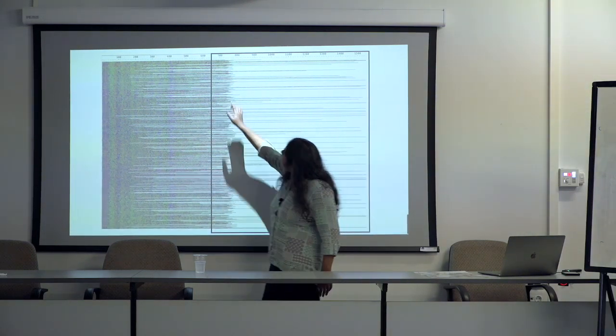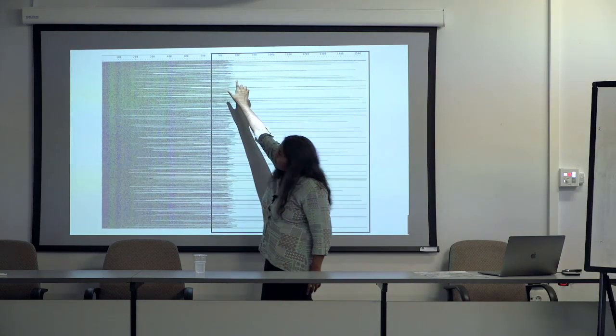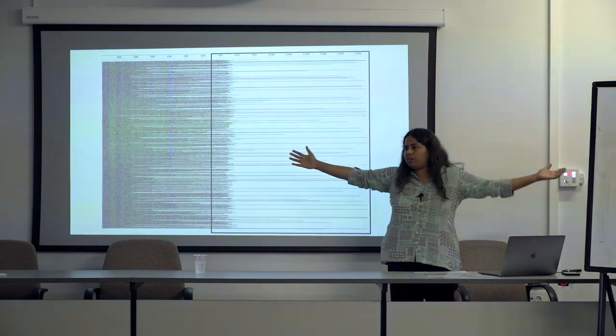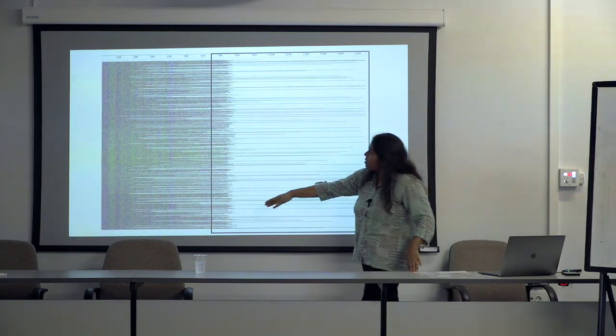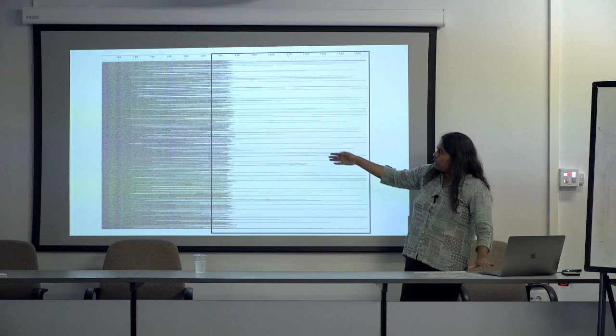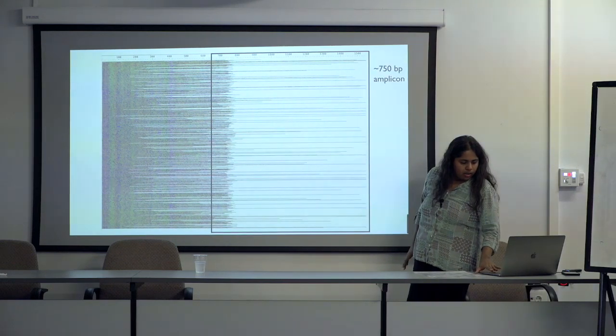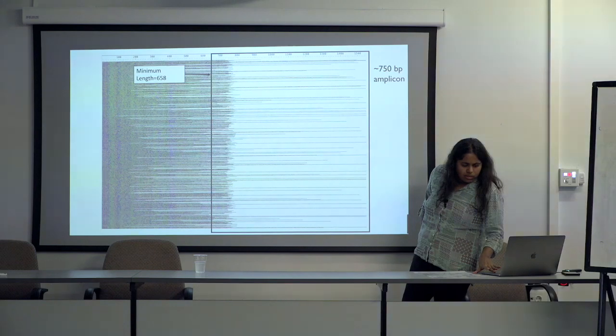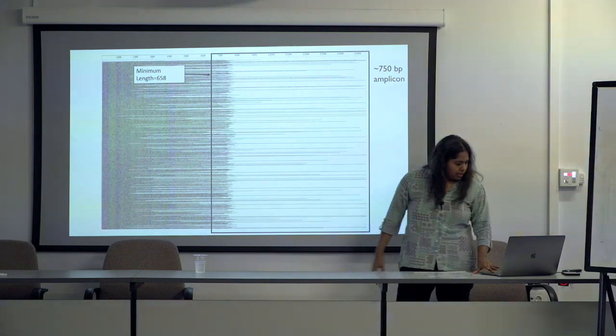So if you are having a 658 base pair cutoff for a 730 base pair molecule, which is your barcode plus primer plus tags, this is the length profile that you would be selecting for by the minimum length criterion. And so you're basically discarding all the shorter stuff.